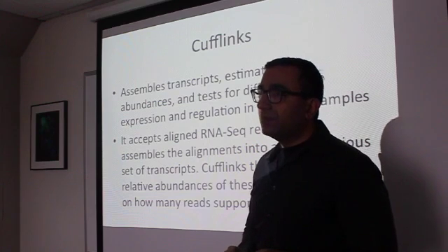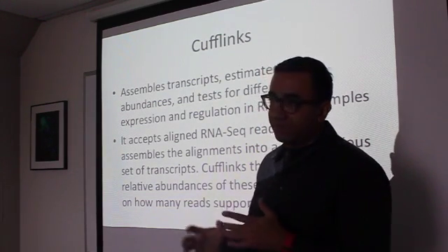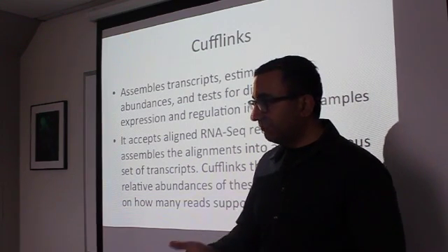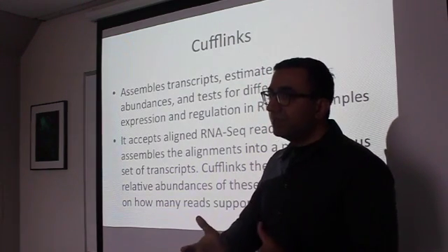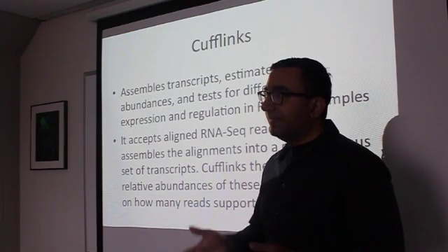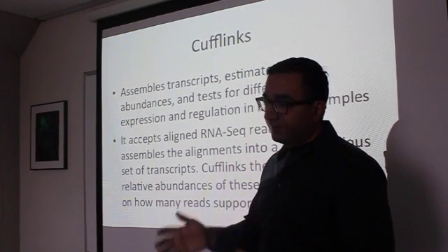So that is why a lot of the bioinformatics community has moved to using Tophat as the aligner, which happens to be still its strength. And then downstream analysis is done using some other program to count your transcripts and your reads, how they align to those transcripts. And then for differential expression, people use multiple programs, and we will be covering that process as we move along.